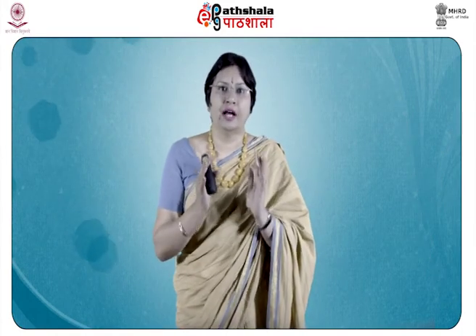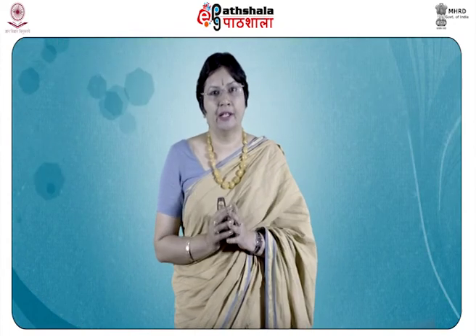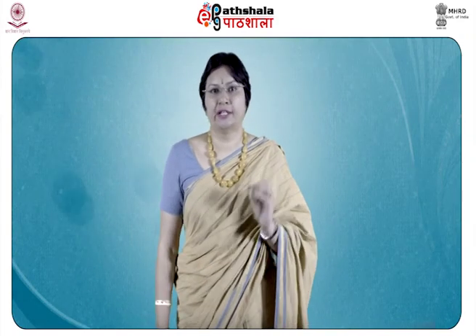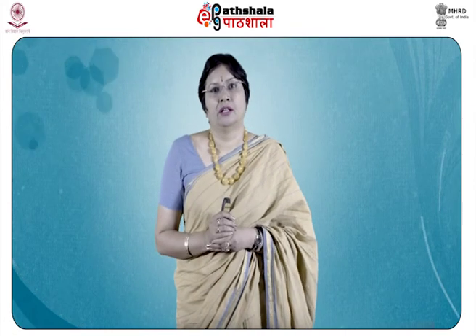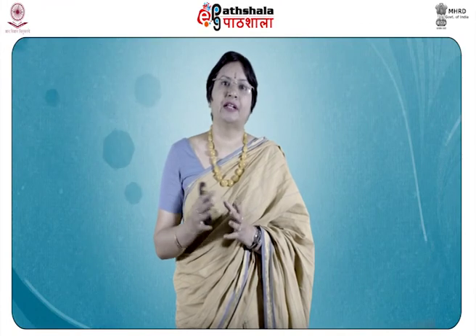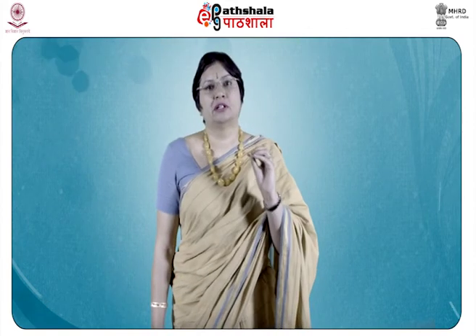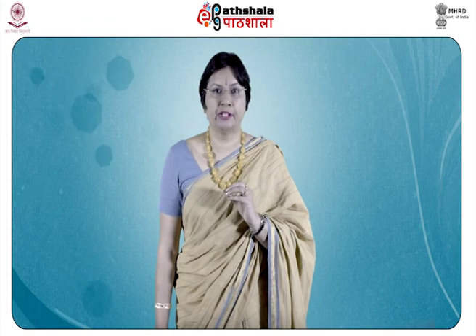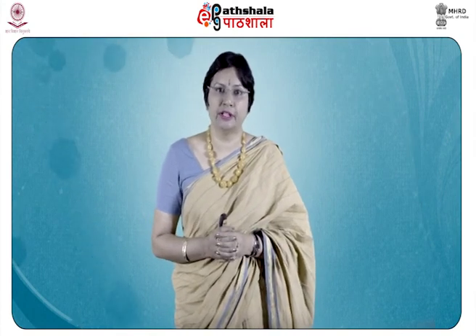So, after knowing all these tests, I am sure you will be able to analyze the post blast residue and find out what cations and anions are present, and correlate them with the cations and anions present in that type of explosive material. It will give a clue as to the type of bomb or the explosive material that was responsible for creating that explosion at the scene of crime.